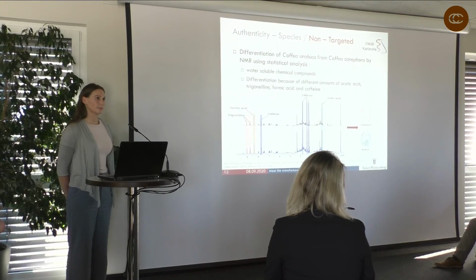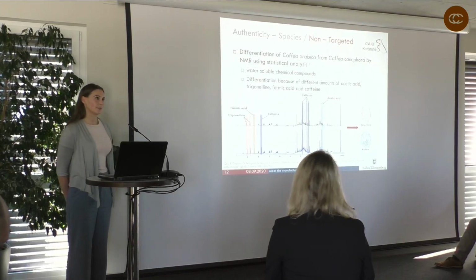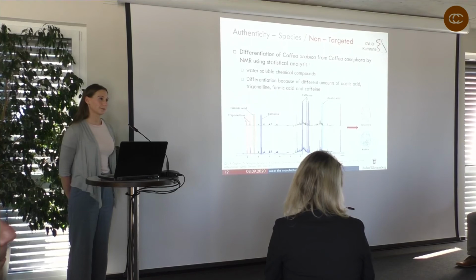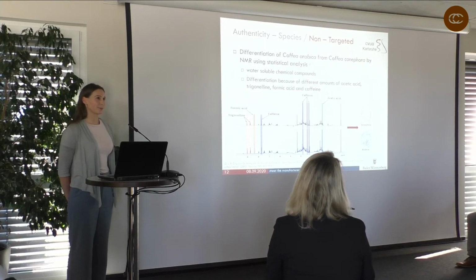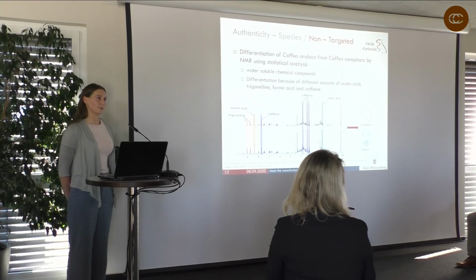If we have valuable data, that will most likely be the problem: to find a coffee bean we can trust. Because it's very easy, someone gives us a bean and says this is from Kenya, while it is actually from the Philippines. So if this is the value we believe in, and we start looking into this, then we are lost. So we always have to know where we get the trustworthy material from to calibrate ourselves. I think that is one of the main things. But doing this, I'm very positive that we can understand more and more, especially when we work between the different disciplines, between different institutes, and really have a good exchange. Then this can get us tremendously forward.